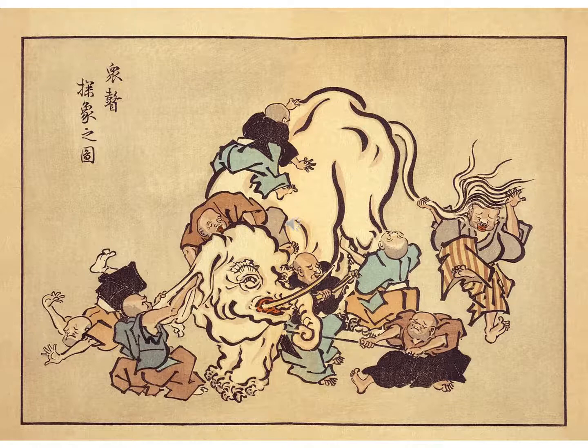So their perspective on the elephant is very local. And this really is one of the great things and one of the problems with small angle scattering. And as we progress in this webinar series, you'll see this picture again. And I'd like you to think about this analogy.